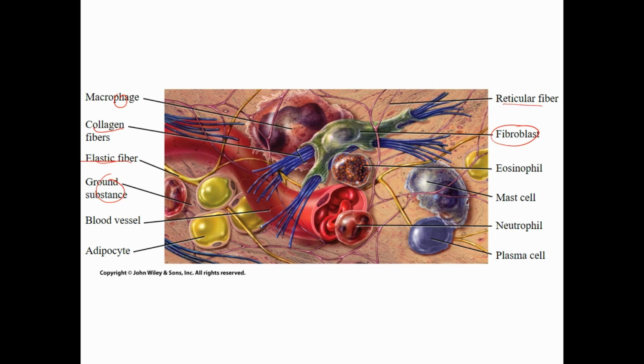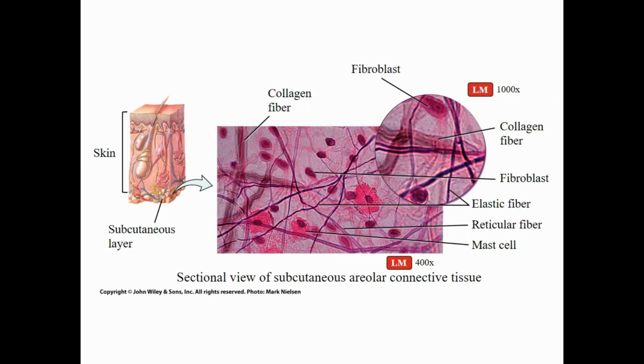We also see the reticular fibers. This is a connective tissue that has it all. So it's just general, no particular kind. This is a particular kind of connective tissue. So remember, we have loose, we have dense, we have cartilage. Those are your three big types of connective tissue. So these first few are going to be different kinds of loose connective tissue.